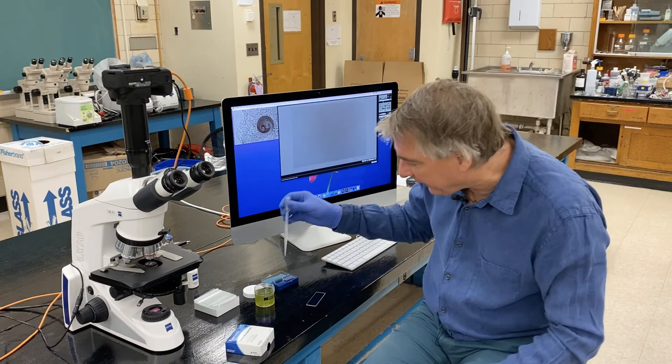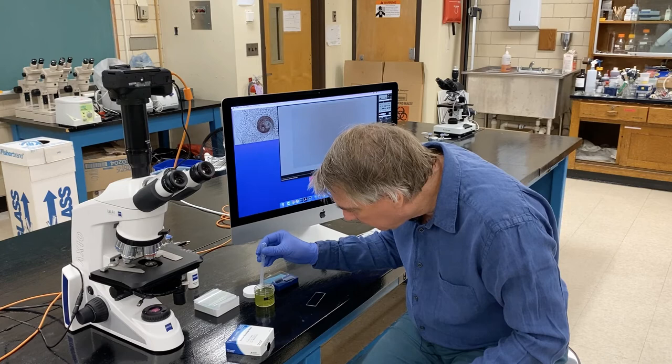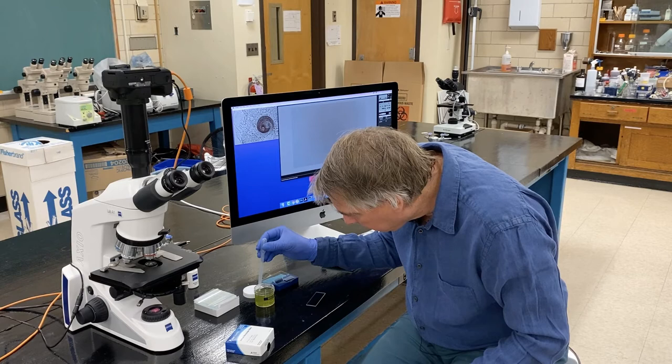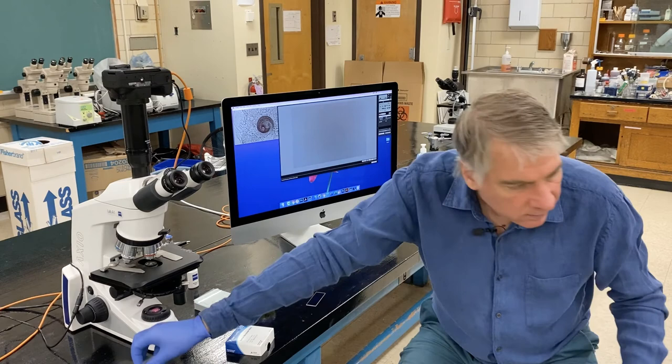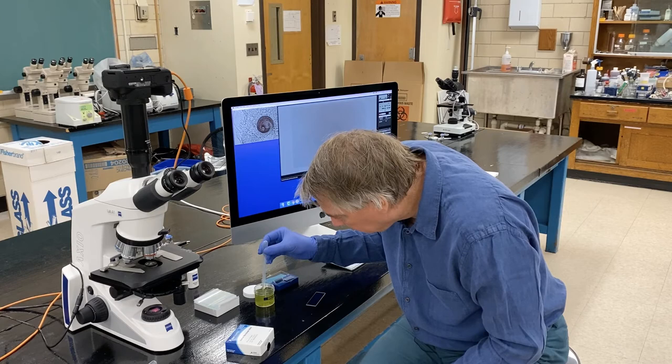So I'm going to go down to the bottom, suck up some of the stuff on the bottom, and then put. I think this pipetter has a hole in it. It's not sucking it up. Let me get another one. There, that one worked.